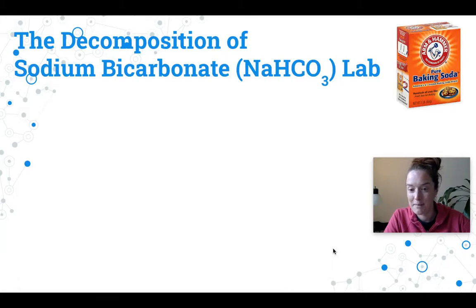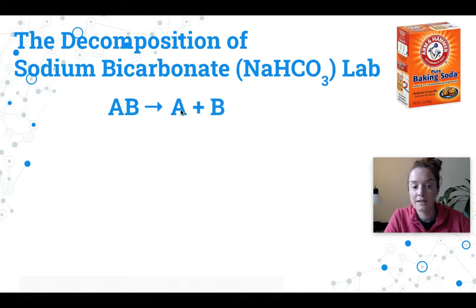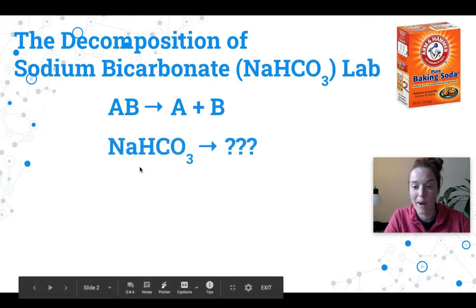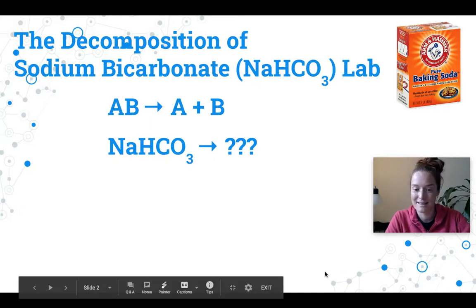And so just as a reminder, a decomposition reaction is when one large compound breaks down into two or more smaller compounds or elements. And so part of the challenge of this lab is to figure out, when we heat baking soda, when we heat sodium bicarbonate, what does it decompose into? What products does it break into?